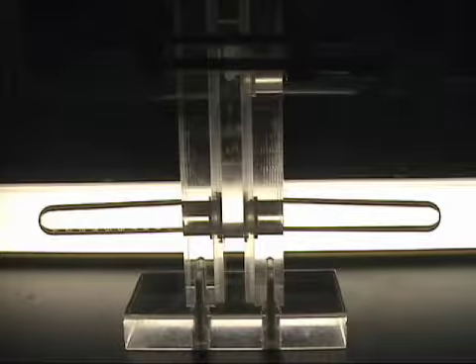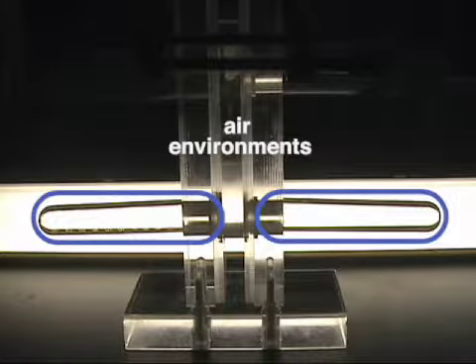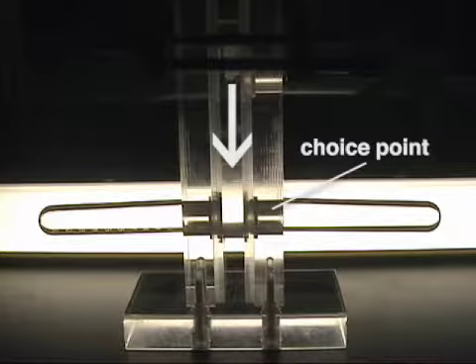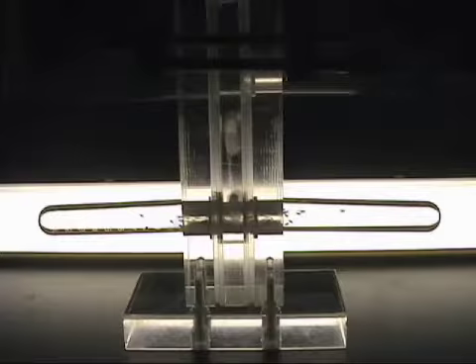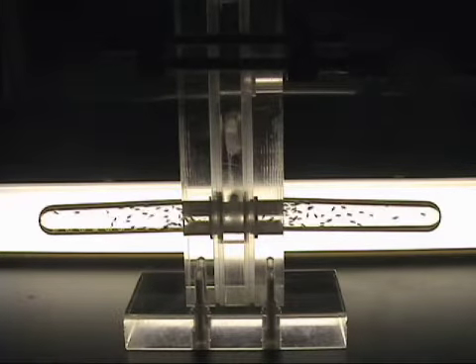In this experiment, Drosophila, or fruit flies, are placed in a T-maze and presented with a choice of air environments to test their sensitivity to specific odorants. The flies are transported down the maze in a central elevator to a choice point where they have the option of entering either arm of the maze. In the control trial, both arms of the maze contain fresh air. As we observe, the flies show no significant preference as to which arm they enter.